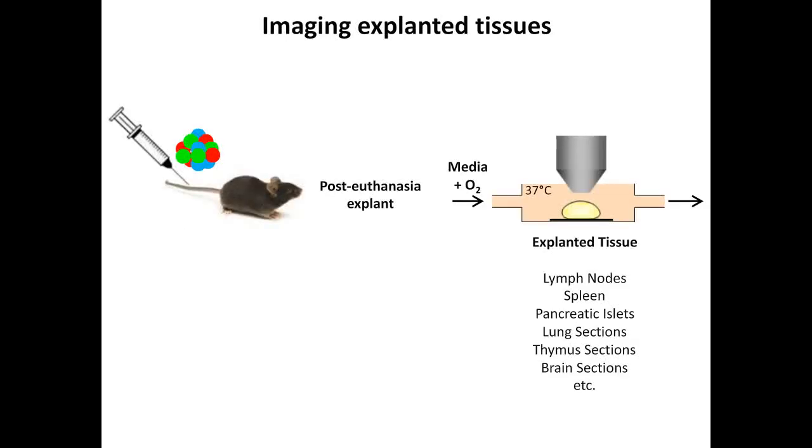So I'll now switch and give some specific examples of the type of imaging that we can do and analysis that can be obtained. So first I'll start with some examples of explanted tissue imaging.